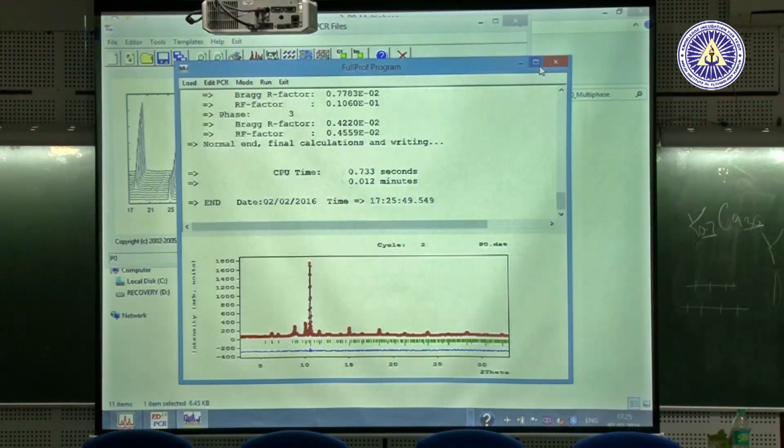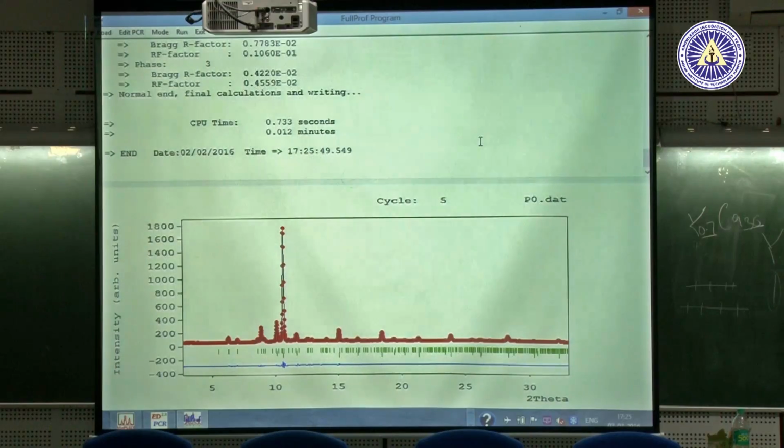But here your life is easy because nothing is going to happen to your gold and tungsten. Actually, it's not excluded, sir. No, but I mean, if you were to have a phase transformation in your material, it actually comes out in the pattern, so it will be difficult, right? Actually, I don't have a solution. Everybody is doing it with phases. Actually, this measurement is not done here, it's outside. No, but that's why you need synchrotron, because your wavelength is so nice that all the peaks will be spread out. Yes, sir. So it took 1 month for one measurement.